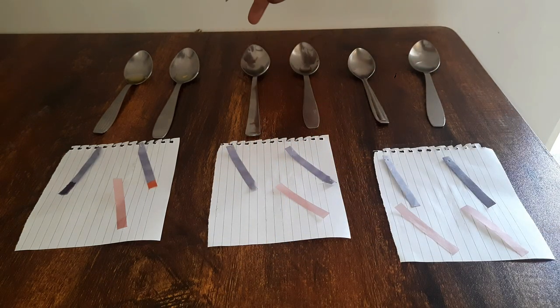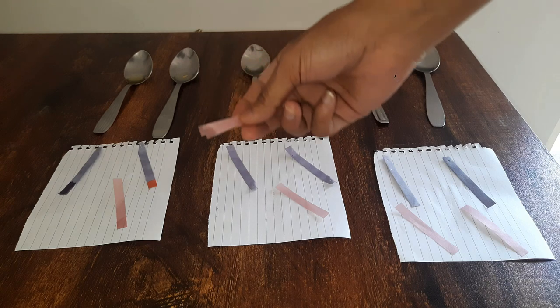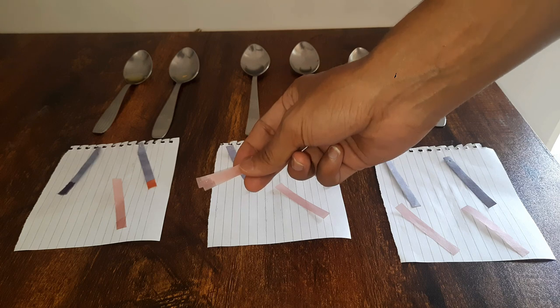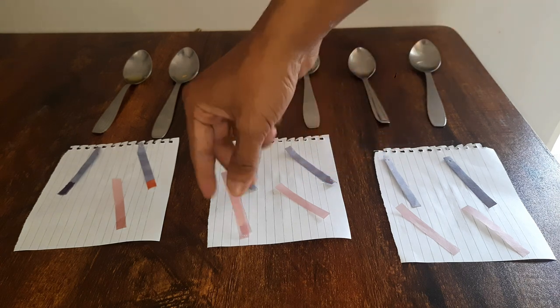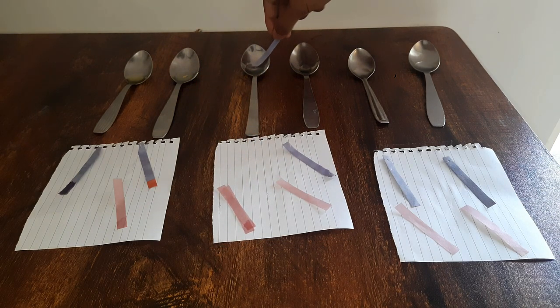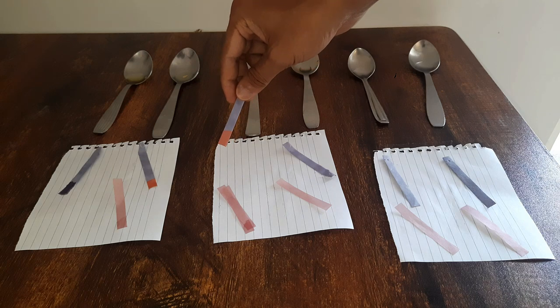Now this is vinegar. We took two papers, but as you can see, nothing's happening to the red litmus paper when it comes in contact with vinegar. Let's take the blue one now — and there you go, it turns red, which tells us that even vinegar is slightly acidic.